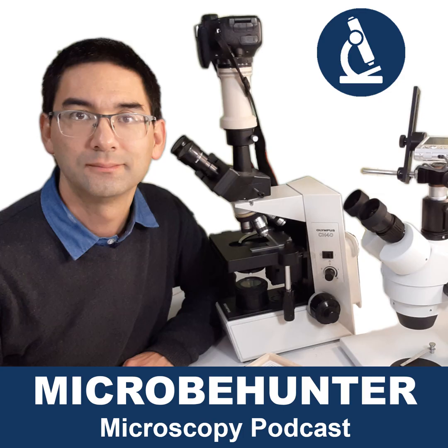I'm saying this because I know that some people who are brewing their own beverages using yeast sometimes do a quality check by doing a cell count, and then they also use microscopes, of course. But you do not need phase contrast or DIC or anything fancy for that. You can use regular bright field optics for doing a cell count.